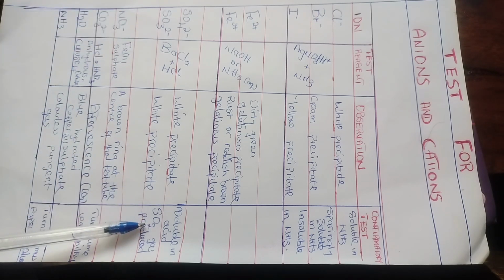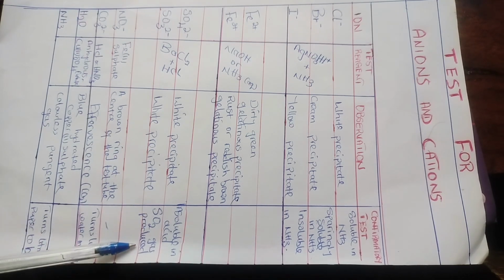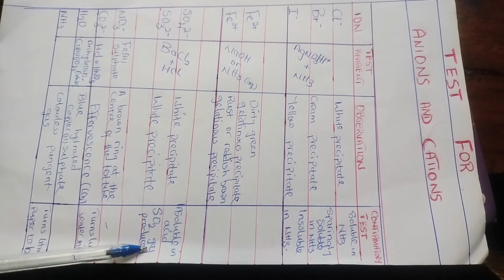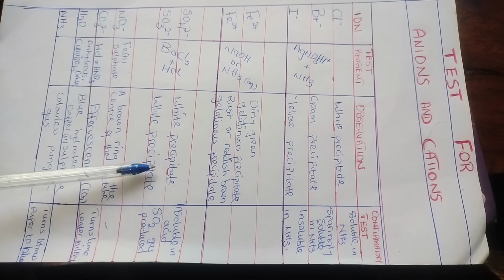ion, what happens? It produces sulfur dioxide gas. Summarily, we are saying that if you see a test reagent as acidified barium chloride, what should come to your mind is that they are testing for the sulfate and the sulfite ion, and all of them will produce a white precipitate.